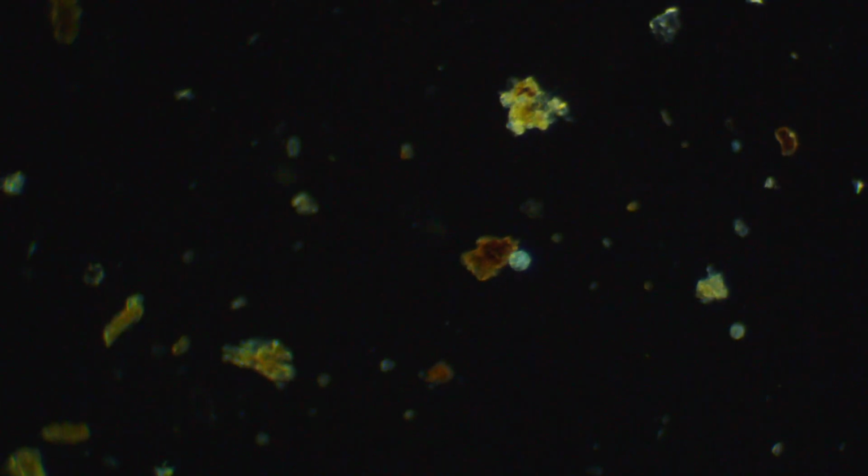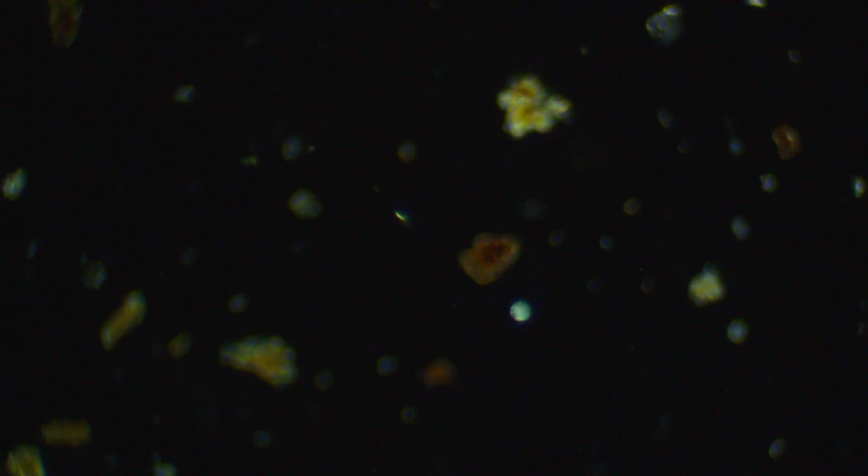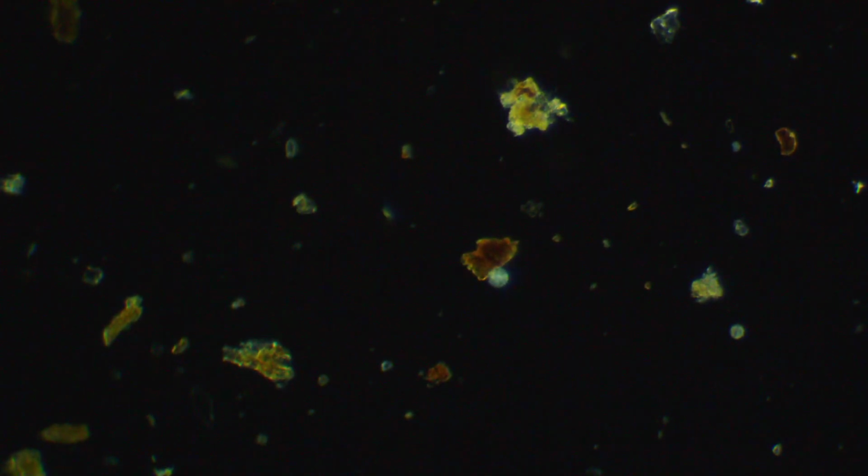I would definitely take some Canadian samples. That would be awesome. Standing water with any kind of growth in it, moss especially, or lichens. And I'm told lichens and moss that are growing on wood specifically, like fences, trees. Although, I mean, I have one sample of some moss growing on a tree, and it didn't have anything too interesting. But I find something different in just about every sample.